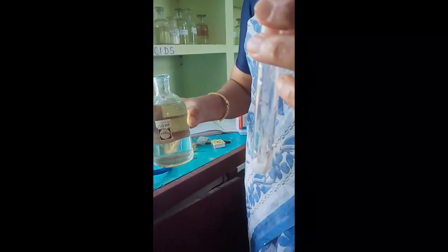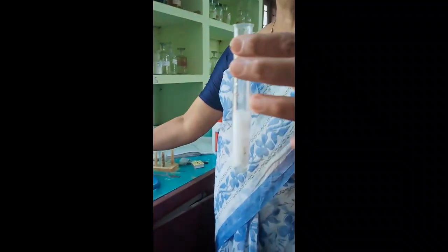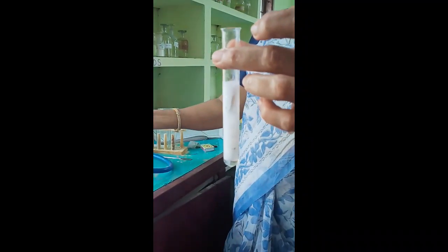Colorless gas is hydrogen. So here you can see a reaction, and during the reaction a colorless gas is evolved, and we are testing the colorless gas. The gas evolved is hydrogen, which burns in air with a pop sound. So we are observing the pop sound. Can you hear?